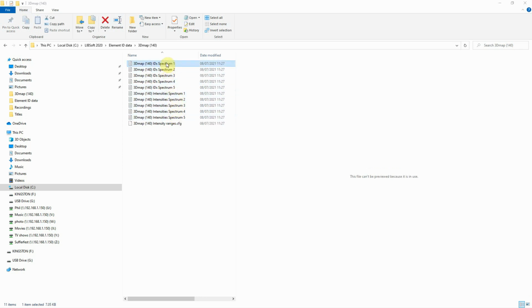The primary use of these result files is so that they can be loaded back into Libsoft for display of the table of identification results and maps. They can also be opened in any suitable text editor or as delimited files in Microsoft Excel.